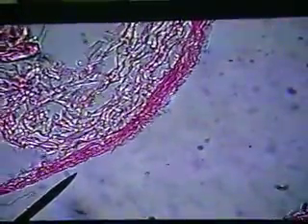You can clear off and clear off, and all you're clearing off is this felt-like adventitia. The adventitia is this loose connective tissue layer, and the tunica media bears no real resemblance to what we saw in an artery. It's very reduced, so the smooth muscle layer is very, very reduced, and the tunica intima is adherent. So the vein is very different in looks to the artery.